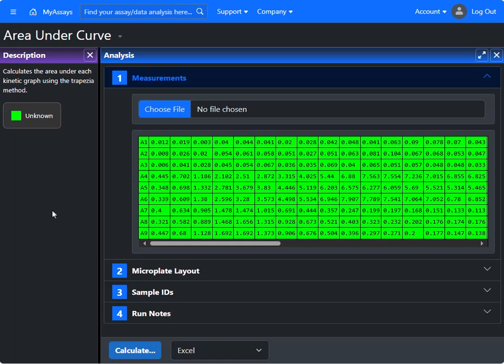Example reductions are peak, reaction rate, for example slope during the linear phase, or the area under the curve. These reduced values serve as the foundation for further analysis, such as quantitative or qualitative applications.